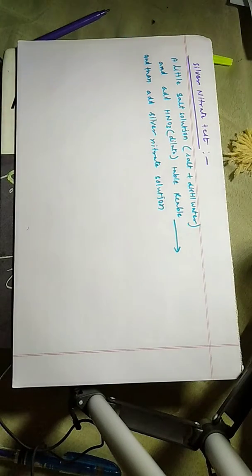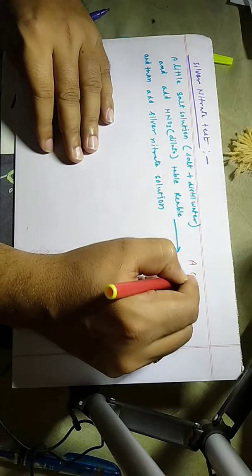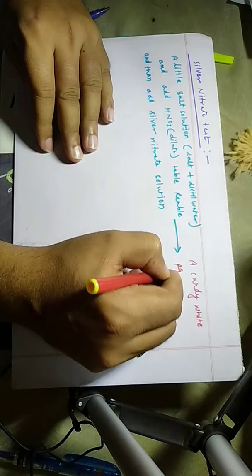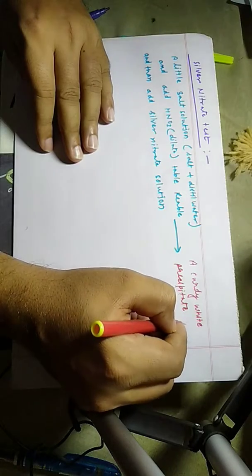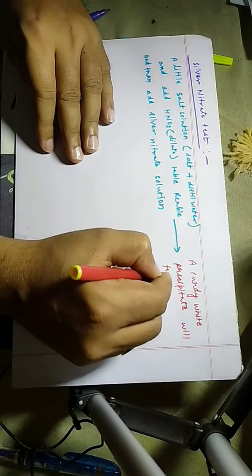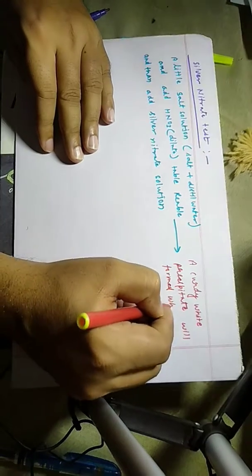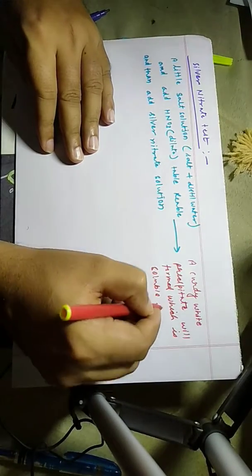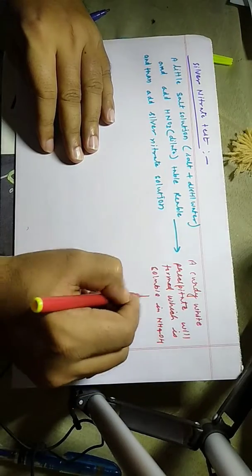If you are doing this, what will you observe? First of all, a curdy white precipitate will form, which is soluble in NH4OH.